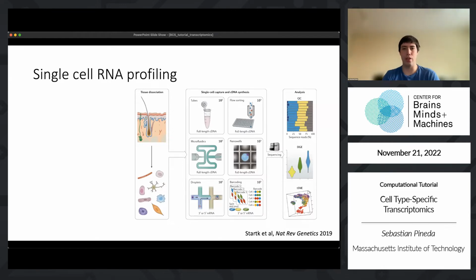If you look in the neurodegeneration literature, or just the neuro literature in general, you'll see that people use the term single nucleus sequencing as opposed to single cell. As you can imagine, that implies that we're isolating the nuclei rather than the cells themselves.